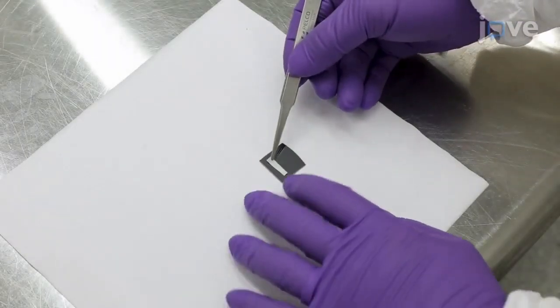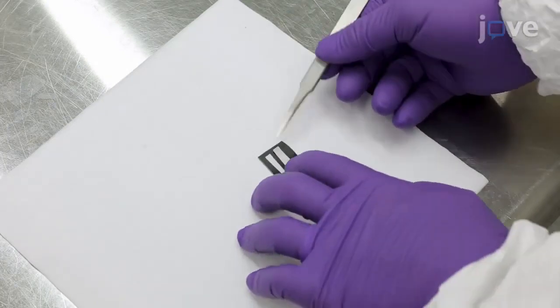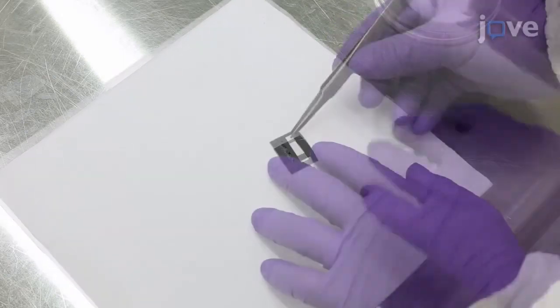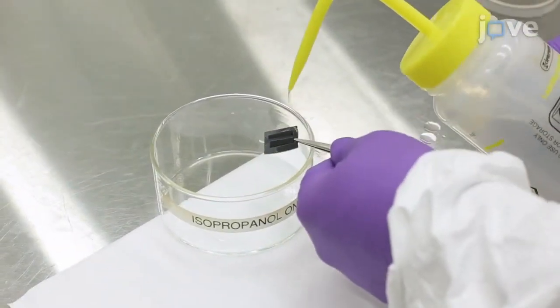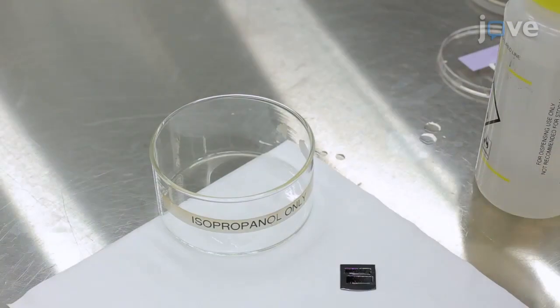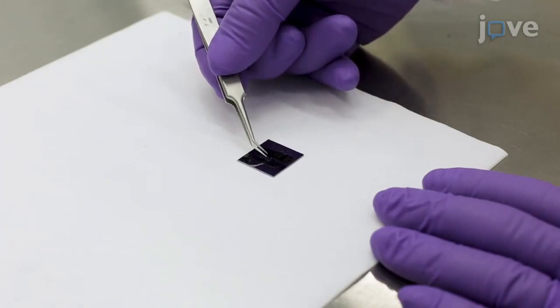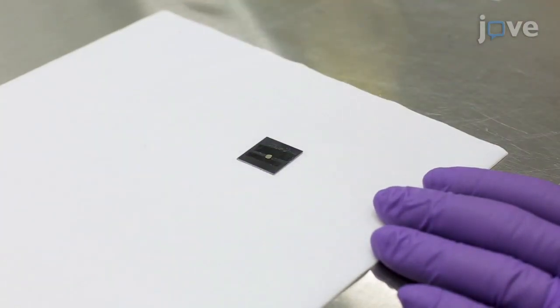To begin, place two strips of double-sided carbon tape approximately equidistant from the center of the silicon holder and separated slightly less than the diameter of the TEM chip. Rinse the strips with isopropyl alcohol to reduce their adhesive strength and avoid breaking the delicate TEM chip during removal from the silicon holder. Mount the TEM chip on the silicon holder, making sure that it is attached to the carbon tape strips only at two opposite edges.